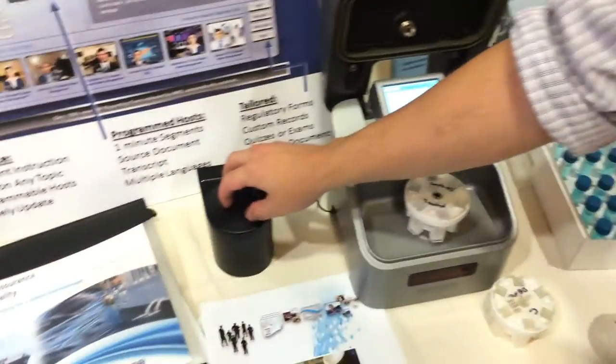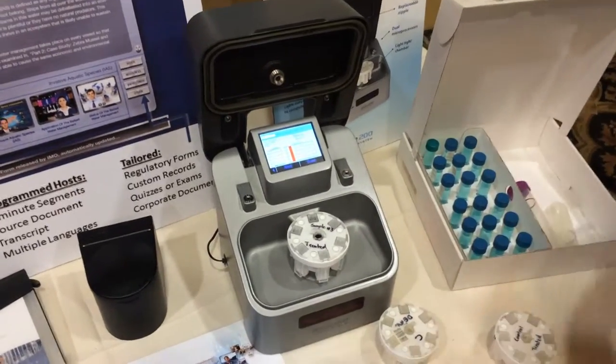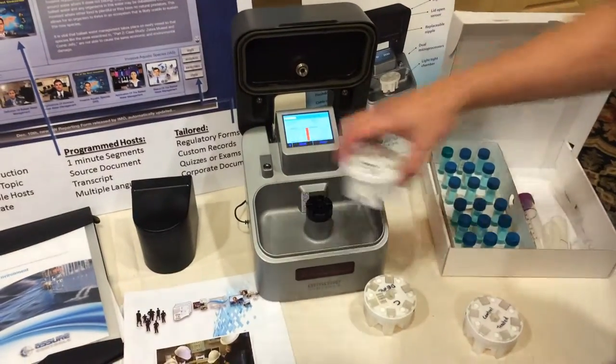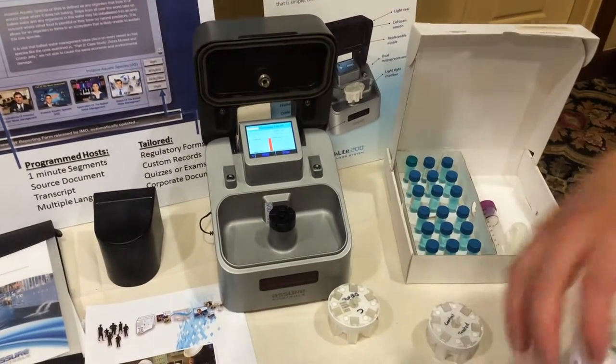So pricing is $5,000, $800, and then $50 test kits. We negotiate with schools, agencies, whatever needs to get done. We have a lot of situations where schools use this at 50% off and then pay for test kits, or different arrangements — it's all negotiable.